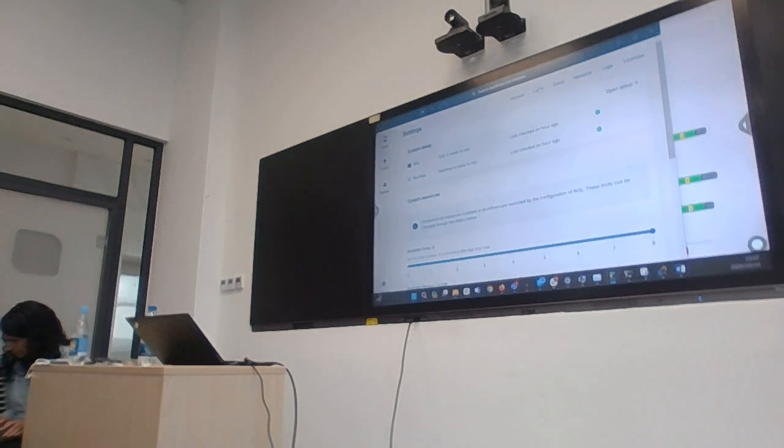Yeah, but now the user doesn't become a member of the group until you... So if I just close this, if I say groups, I'm still not a member of Docker until I think I need to. Yeah, I have to log out.